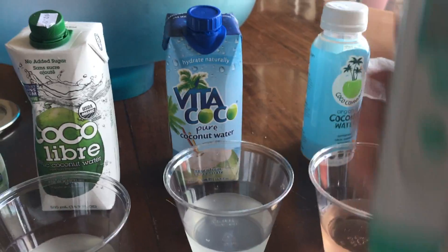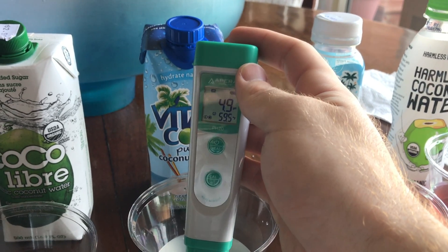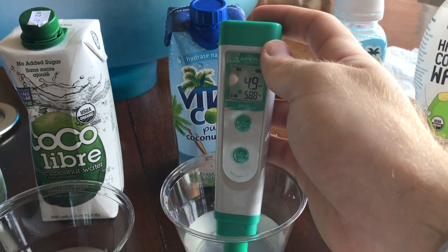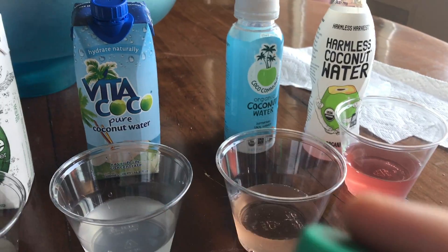Moving on to Vita Coco. Let's test the pH. 4.9. That's about 10 times more acidic than natural coconut water. Just going to recalibrate our meter again and move on to the next one.